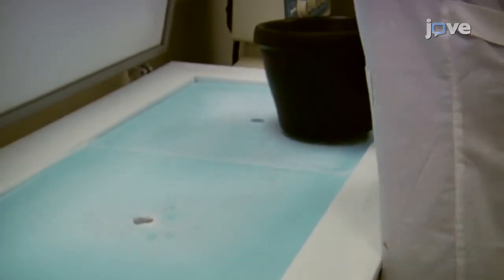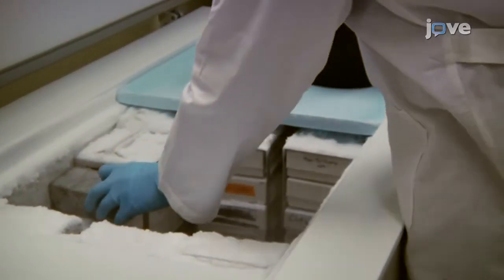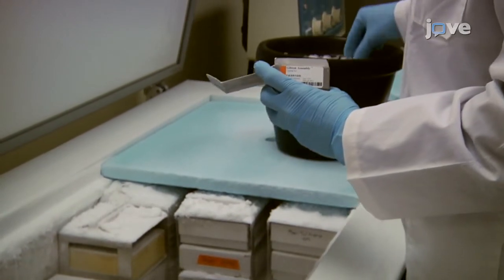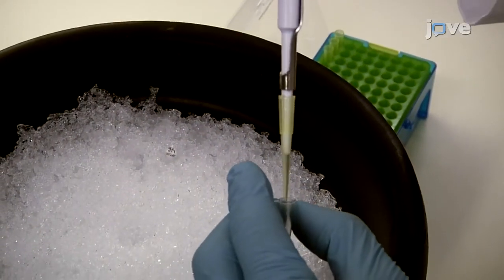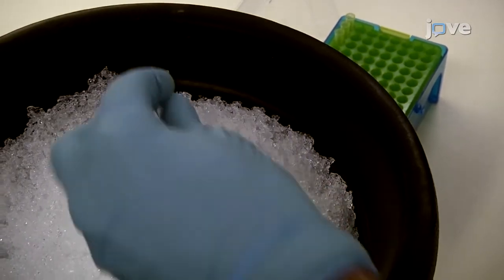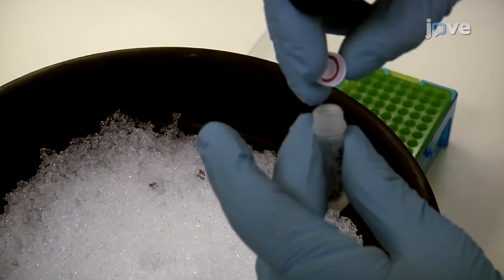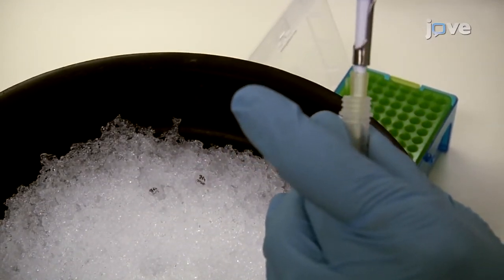Proceed with transformation of the assembly product in competent E. coli or freeze the products at minus 20 degrees Celsius until needed. Follow the transformation procedure that accompanies the chemical or electrocompetent cells. Usually, use 2 microliters of the assembly reaction per transformation reaction.